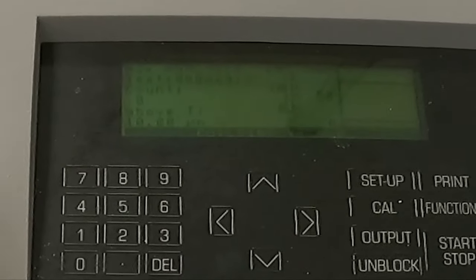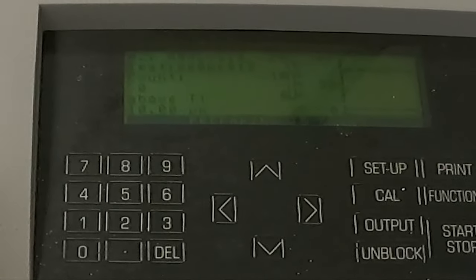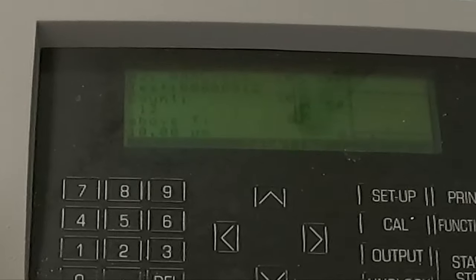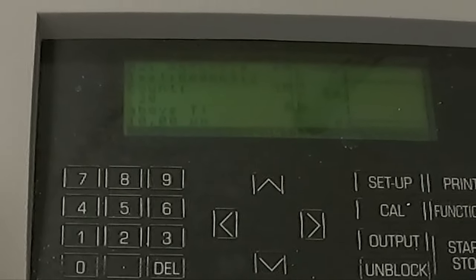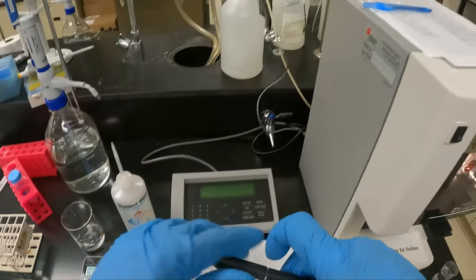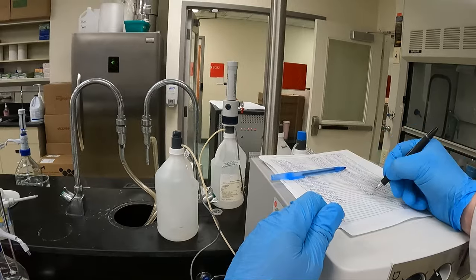So in today's lab, we took some cells that were subcultured. We determined what their concentration was. We had a predetermined final concentration and final volume. We then did a serial dilution. This is more than one dilution, one after the other. We performed this dilution, and I wanted to be within 10% of what the required solution was. I got pretty close, but again, going below times 10 to the 4 is quite a challenging dilution.